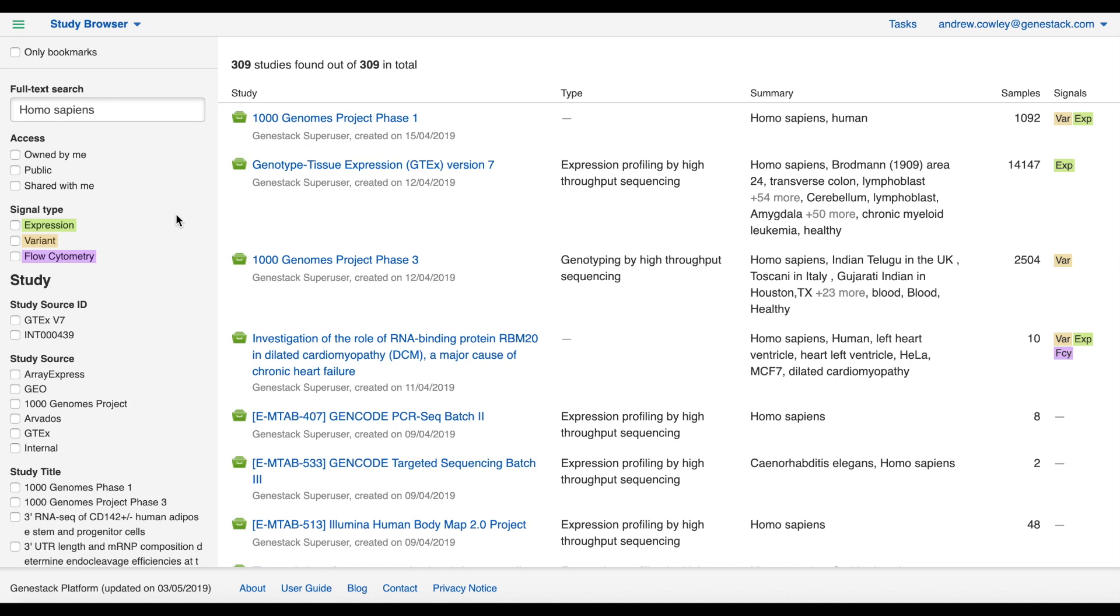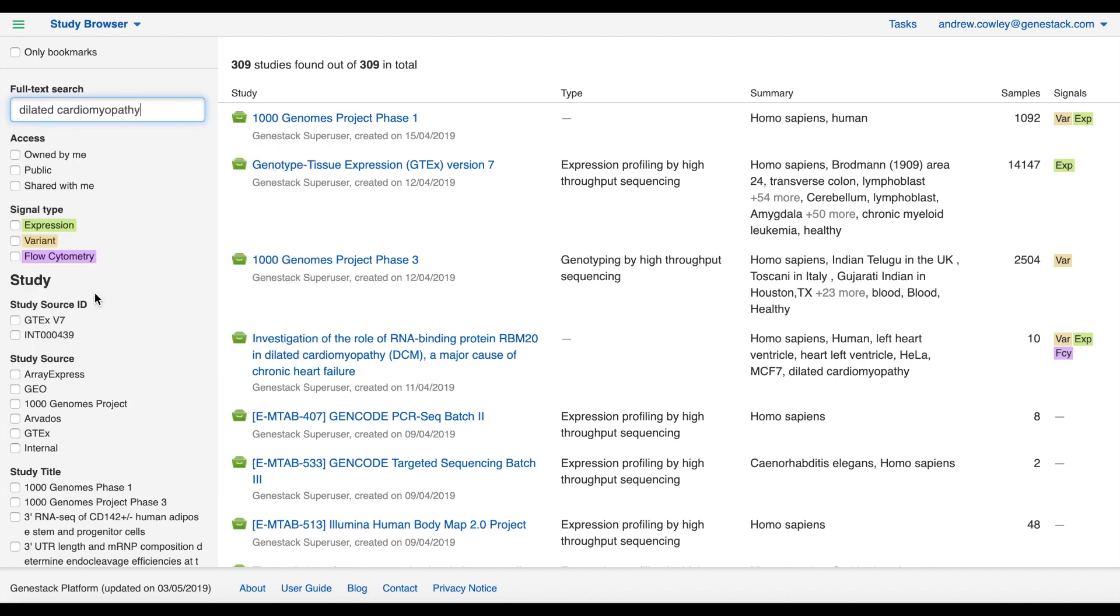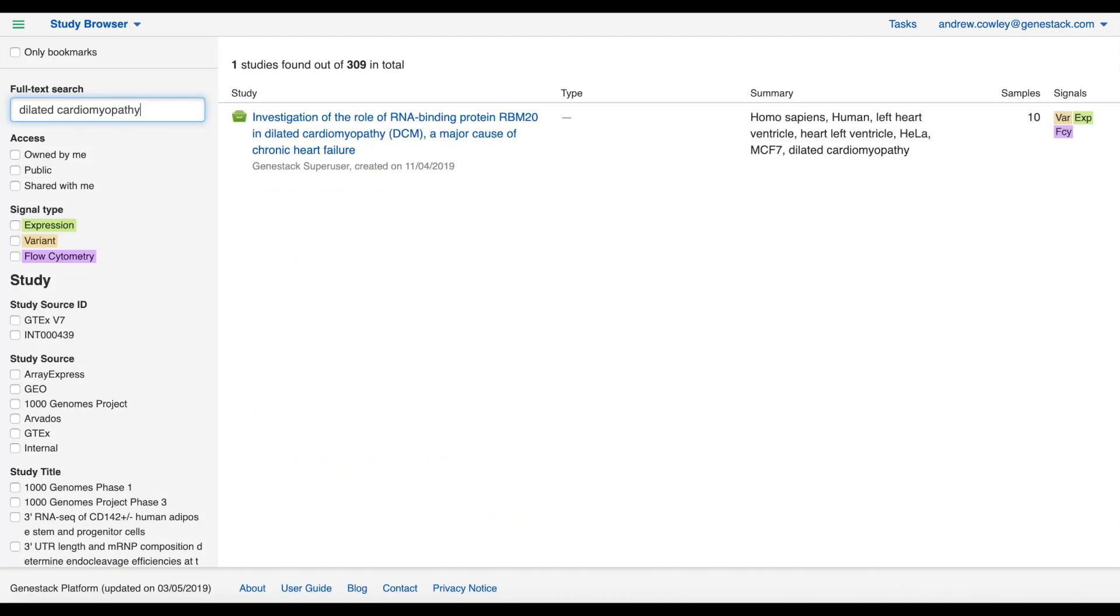For this tutorial I'm interested in finding information about dilated cardiomyopathy, so I'm going to search for that again.